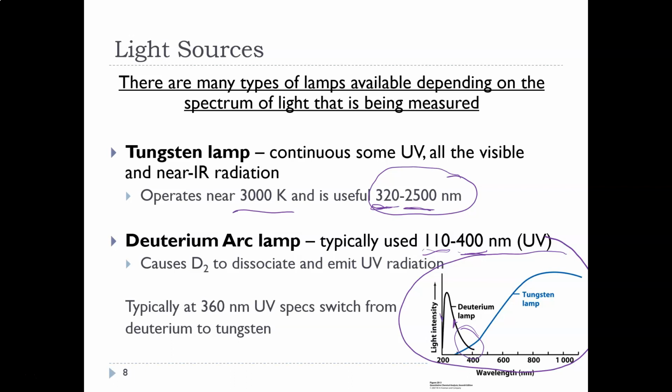So I could ask questions about what are some common light sources of UV visible spectrophotometers, so instruments that go in both the UV and the visible range. These two would be one answer: a tungsten lamp and a deuterium lamp together would be one possible set of light sources, where the deuterium would work sometimes and the tungsten lamp would work at other times.